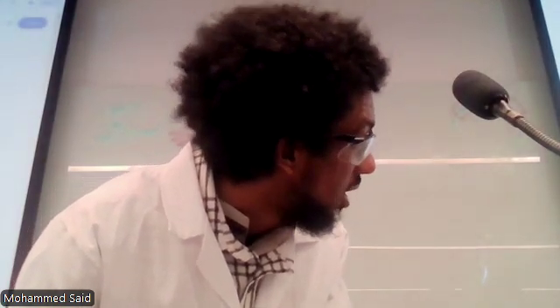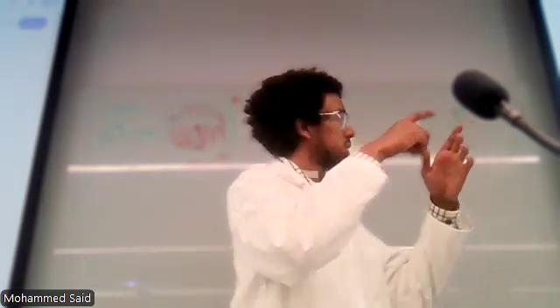Everyone else done? So next, I'm going to put time for 20 minutes to focus on conjugation. It shouldn't take too long. Okay, thank you so much. Just to confirm, you guys suspended both bacteria, right? Yes. Perfect. Okay, so you can place the sample in your middle bench, in that middle tray, and then I'll let everyone else complete it, and then we'll put them all together.